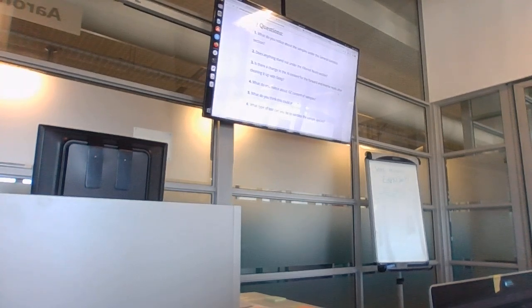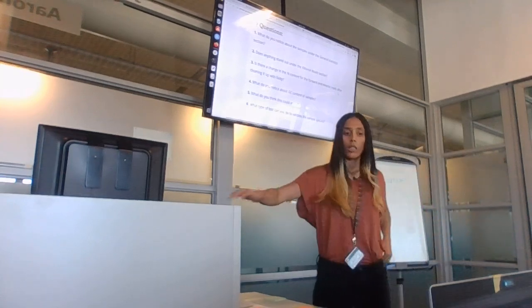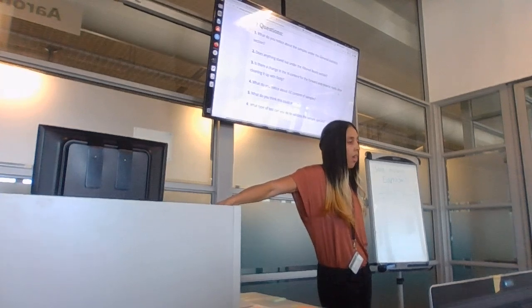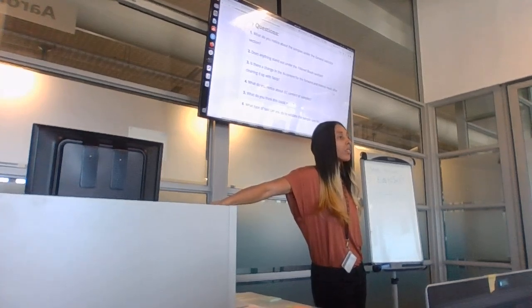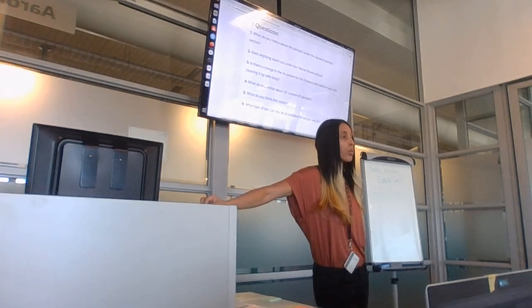As for the difference between FastQC and MultiQC: FastQC is the actual running of a quality analysis on your dataset or your files.